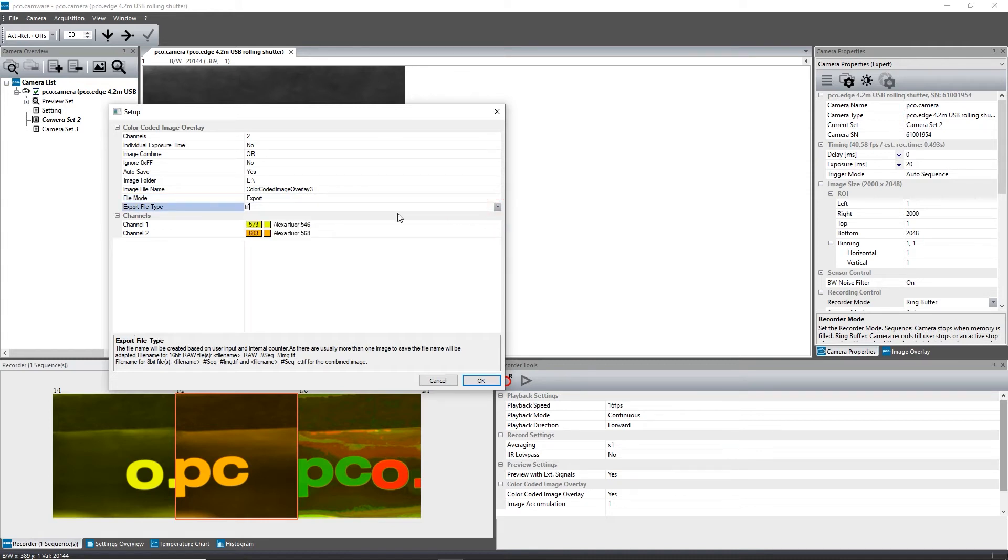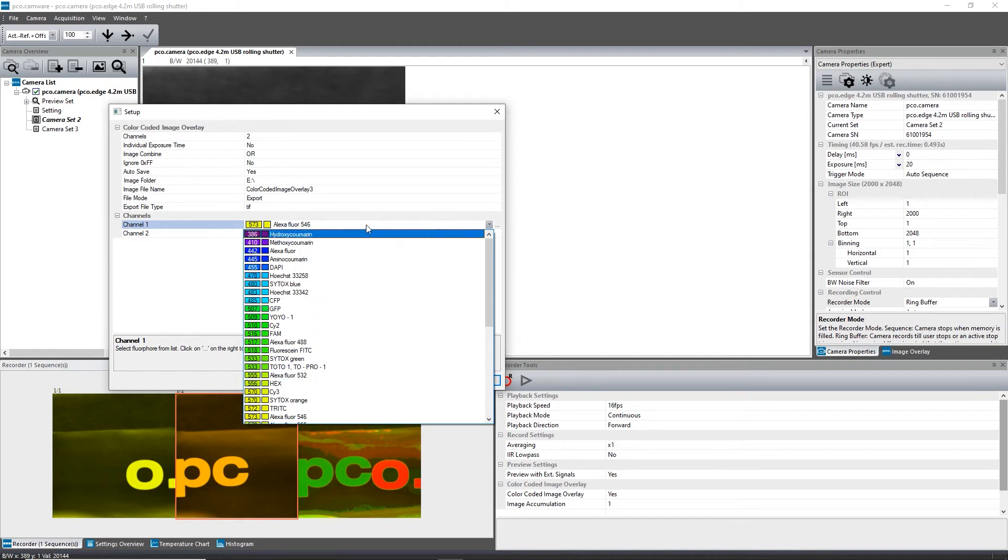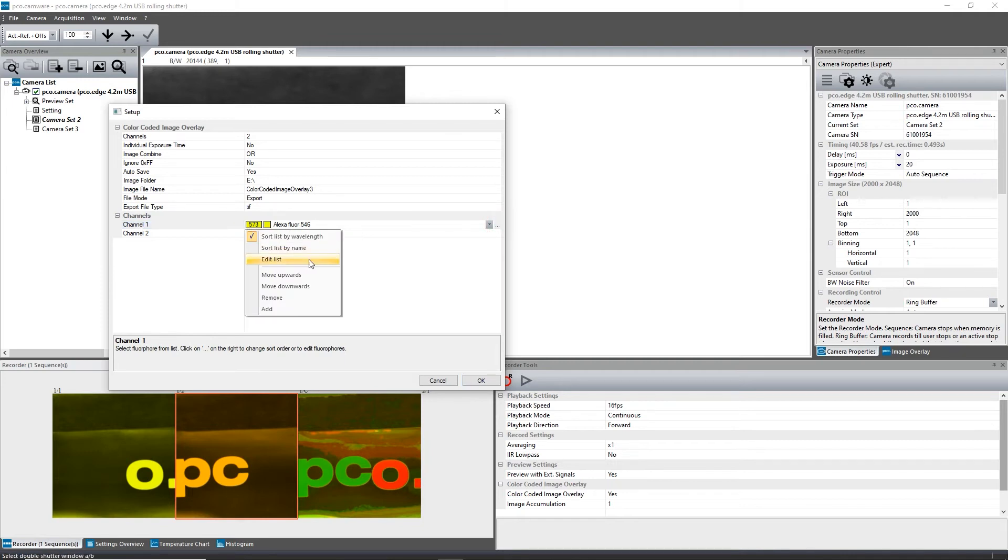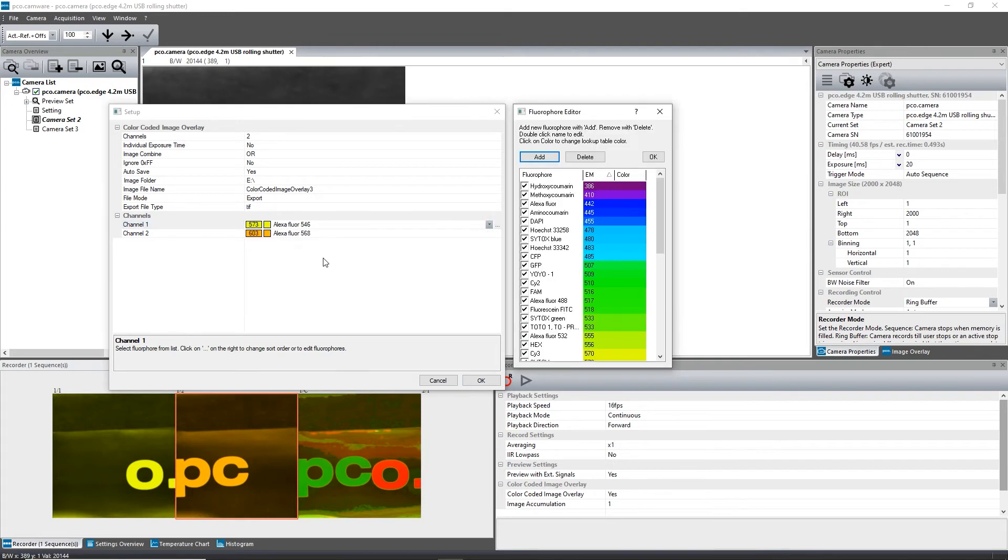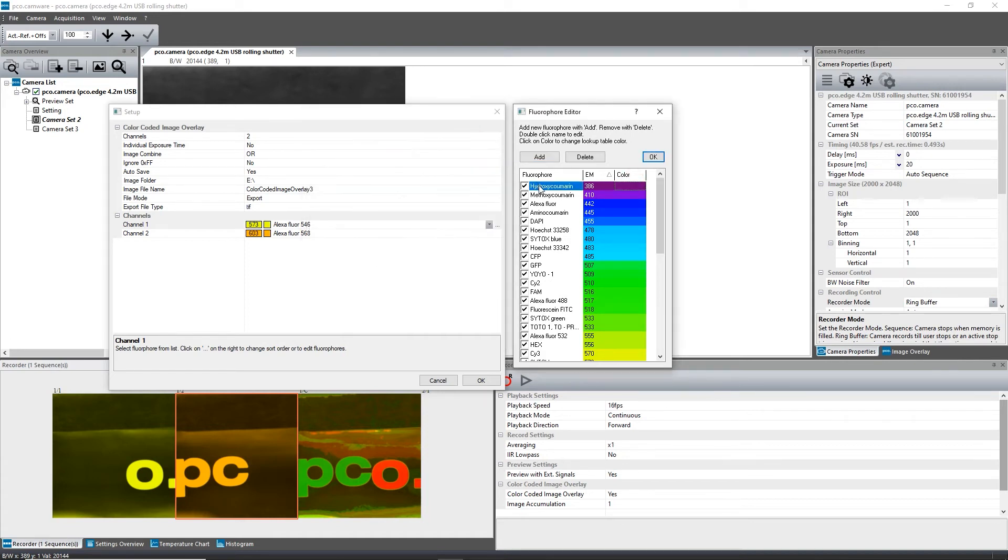In the channels section, you can select which fluorophore you are working with. If it is necessary to change the preset configuration, click on Edit List to call up the context menu. Now you can change the colors using the lookup table. The name of the fluorophores can also be edited by clicking on the name.